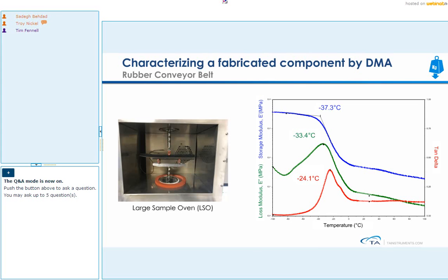Any of these three can be used, and in the standards, you see that all those are brought up. The main thing is to realize that there are going to be some differences between the TGs that are measured with each method, and when you're comparing materials, stick to the same criteria that you used in your previous experiment.